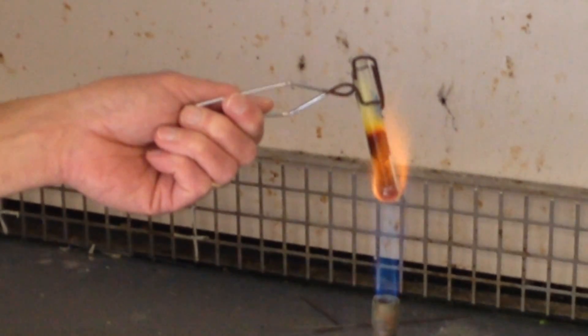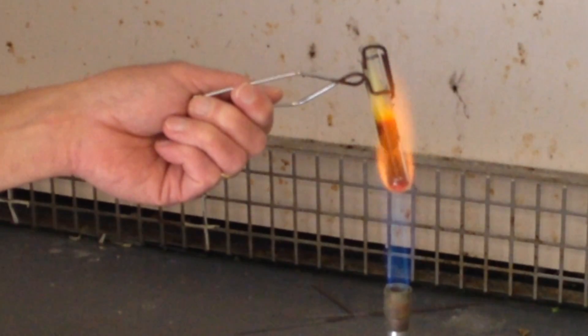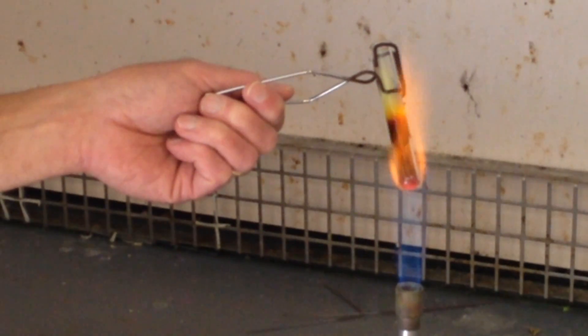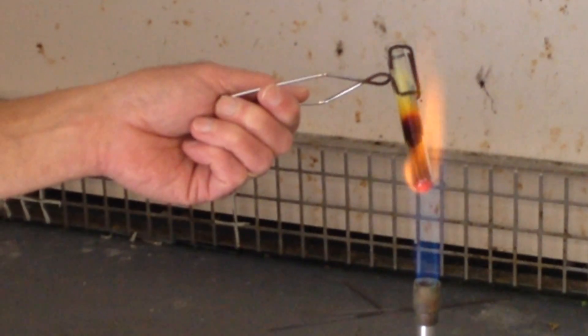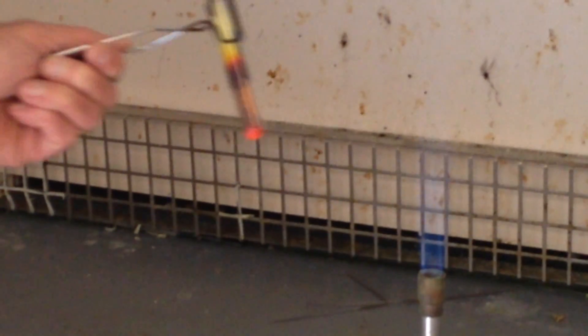Now at this point, I notice the bottom of the test tube is starting to glow orange. And in fact, even if I take it away from the flame at this point, it will continue to glow orange.